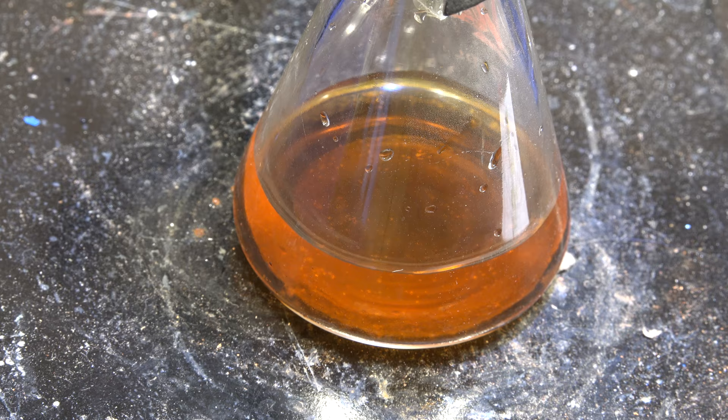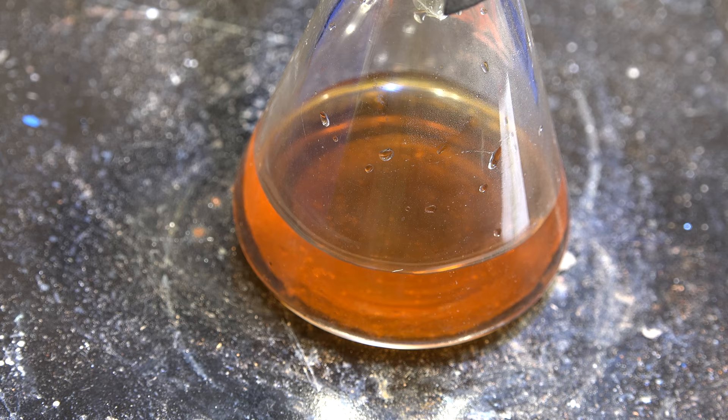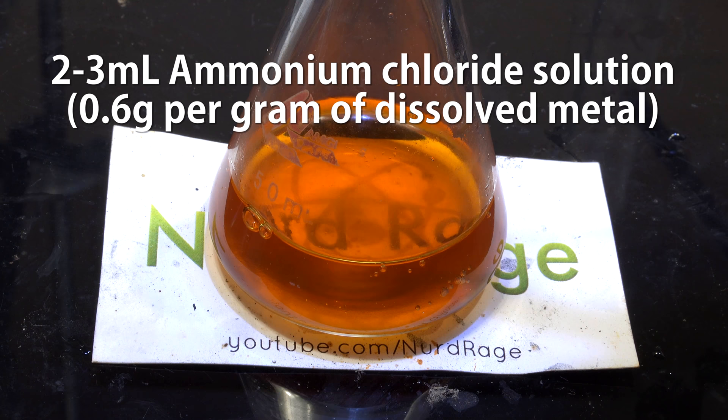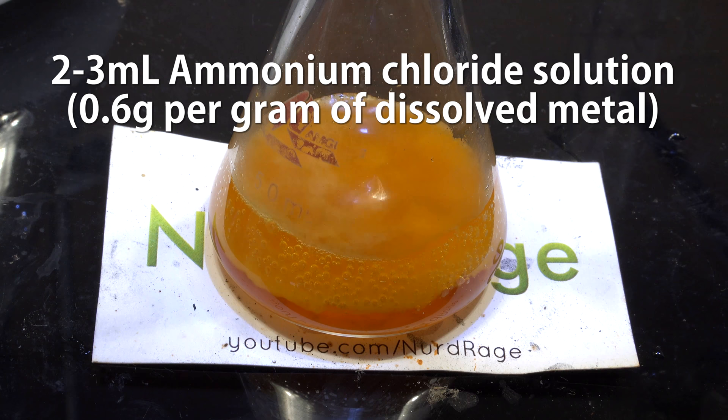Now if you're certain you don't have other noble metals like gold or palladium, then you can add a reducing agent right here, like hydrazine or sodium metabisulfite, to reduce the platinum to metal. I can't do that though, because I was told by the lab this platinum contains a few percent of palladium, so I have to separate that first. To separate out the platinum from the palladium, we add in a saturated solution of ammonium chloride, about 2 or 3 milliliters. Now if you have larger quantities and need more precision, you add 0.6g of ammonium chloride for every 1g of platinum you expect to recover.